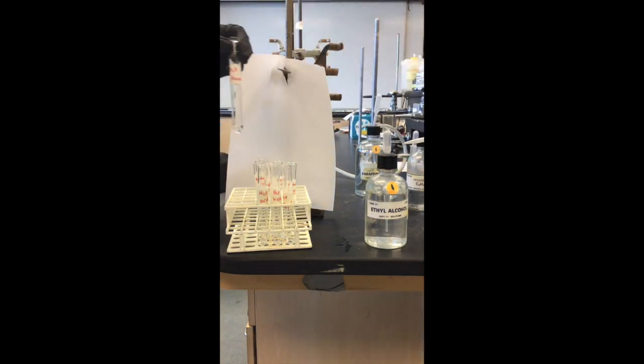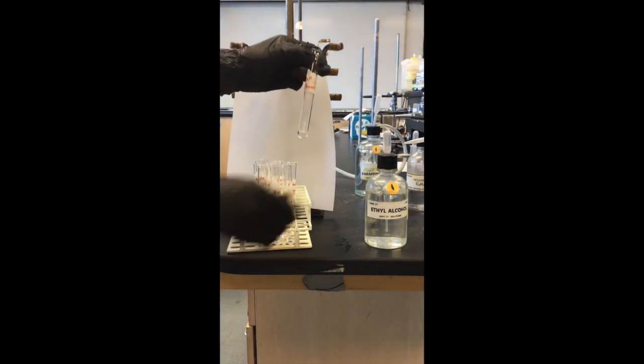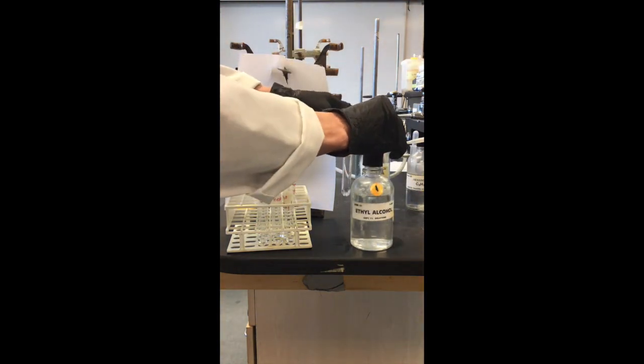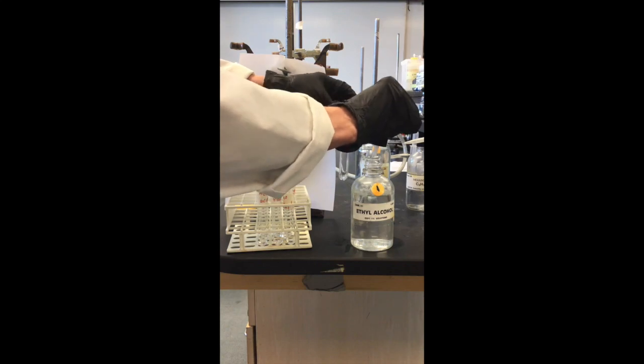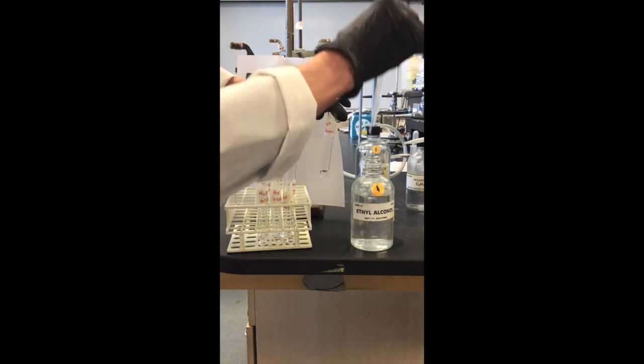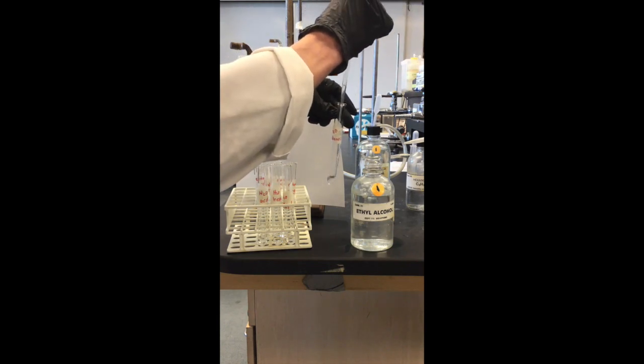Now the exact quantities are not important in this lab. What matters is that we have equal quantities. So I'm going to put my ethanol or ethyl alcohol, same thing. And I want to just make sure that I have an equal quantity. So I can just sort of eyeball it so that it looks about the same quantity of each.